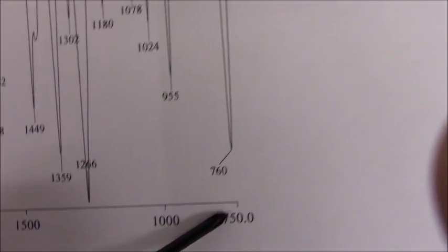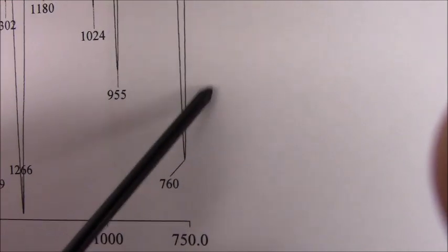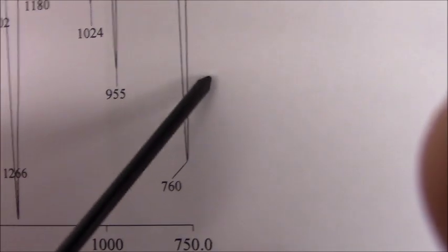Now, whoever ran this one, see how it's only at 750. So this IR is missing. This is an old IR that I happen to have. So basically, when they ran it, yours is normally run down to 450. So there should be a second peak around 680 or something like that here. So normally you see the 2 of them, which is your monosubstituted. So if I bring up the benzaldehyde, you'll see exactly what I'm talking about.